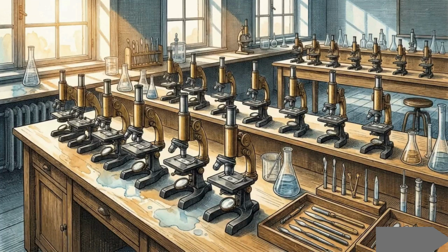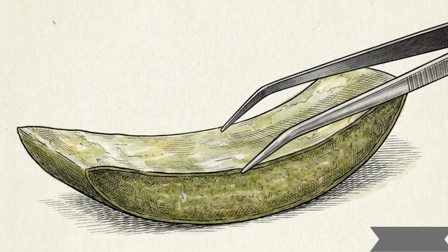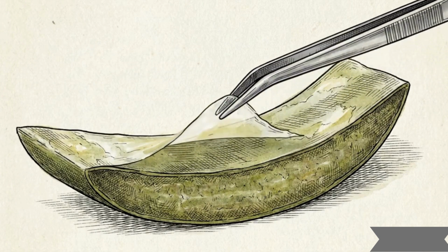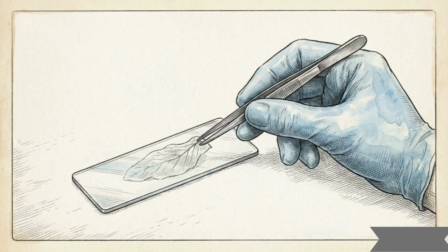The laboratory environment is designed for this process, providing a space where raw biological material is systematically converted into readable data. The first step is extraction. Using tweezers, we peel a layer of tissue that is thin enough for light to pass through it completely. We lay that tissue flat on a glass slide.